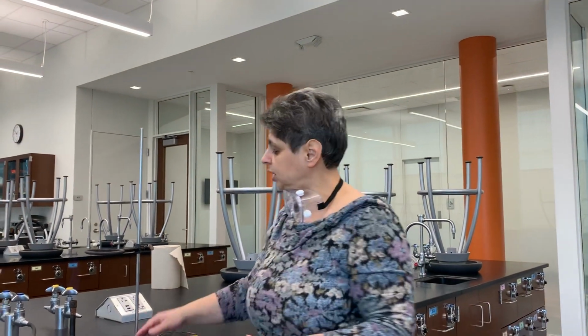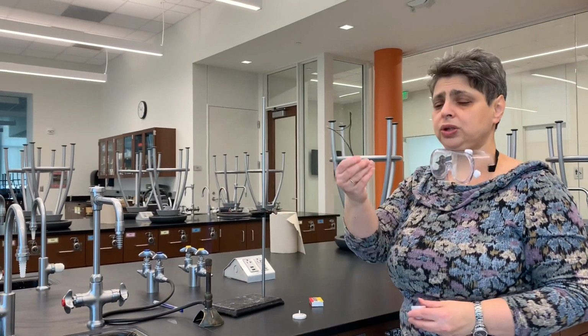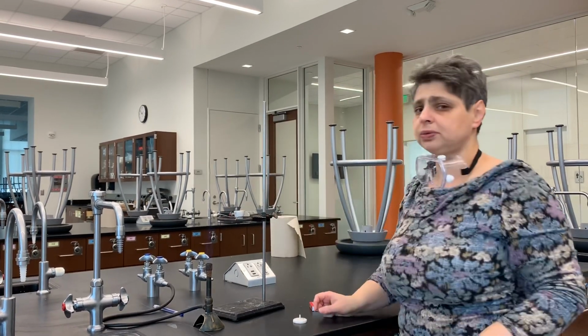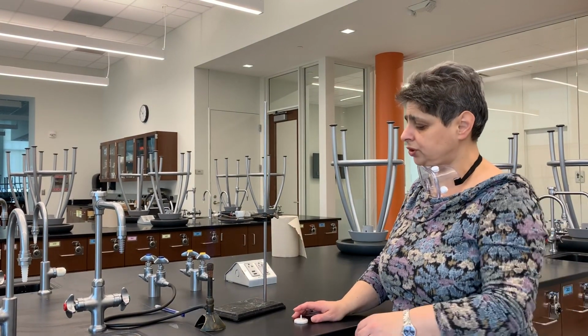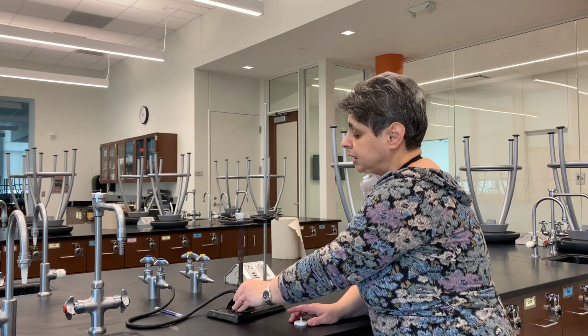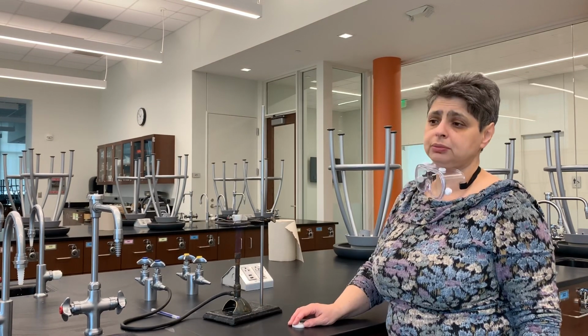So what I have here is a ring stand with a ring holder. I'm going to take a wire triangle and I'm going to position my empty crucible right here on the triangle, and then I'm going to put the burner right underneath it, and I'm going to heat it for about 10 minutes to allow all the impurities to burn.